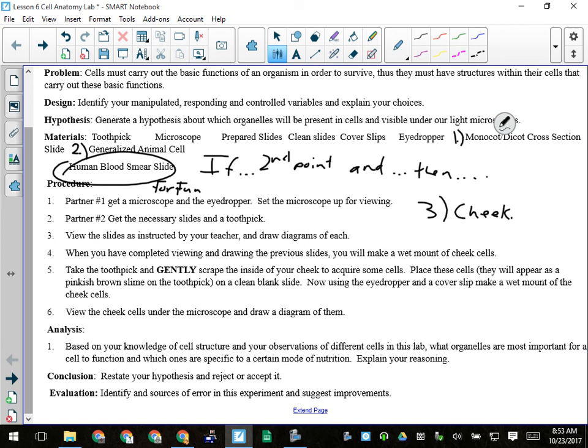Don't. Yeah. So we just use a Q-tip now. Okay. Q-tip still gathers cells, but doesn't... Yeah. Luckily, I never had anyone have the toothpick go through, but they jabbed themselves good enough that they drew some blood. So don't do that.